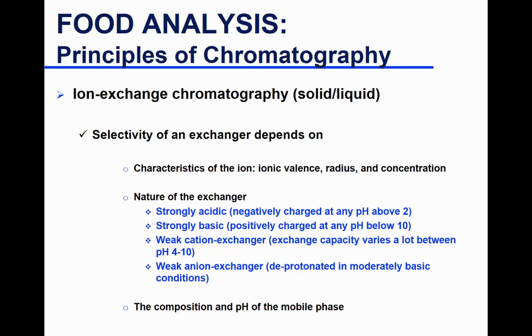Radius, how big it is, the bigger, well, we'll learn in the carbohydrate lecture, there is a combination of size exclusion and ion exchange chromatography, where you can separate on both size and charge. So the size becomes important because it will determine how well this molecule is going to go into the pores and interact with your charged ions on the stationary phase.